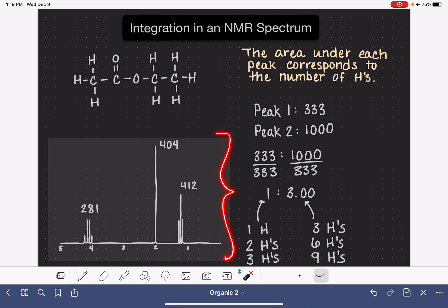Let's take a look at this spectrum over here with its integrals. Again, our job is to look at all of the integrals, find the one that is the smallest, and divide all of the integrals by that small number. We're trying to turn these into normal numbers. 281 divided by 281 is 1. 404 divided by 281 is 1.4. And 412 is also going to be 1.4. So these integrals don't work out to be perfect numbers, which is actually really normal when you're looking at real data.